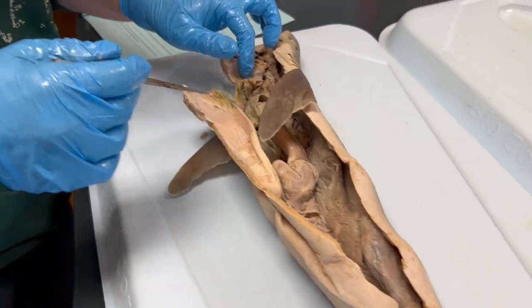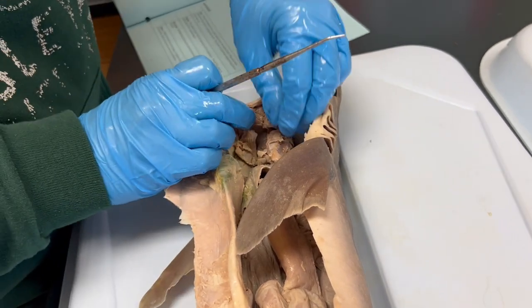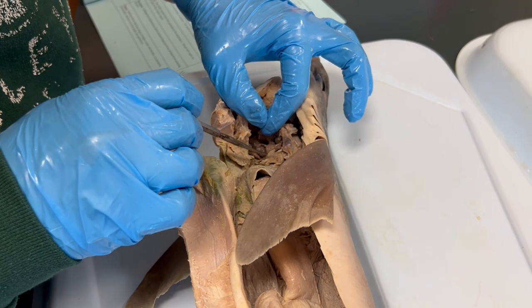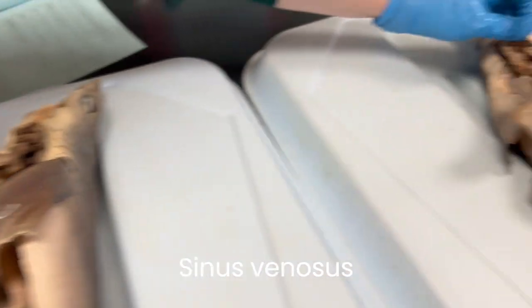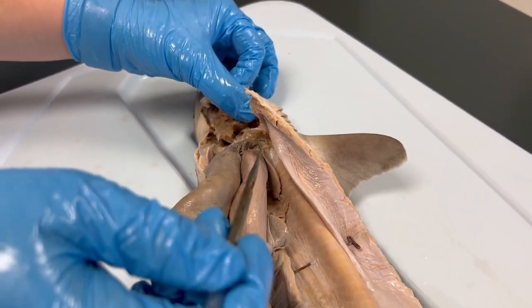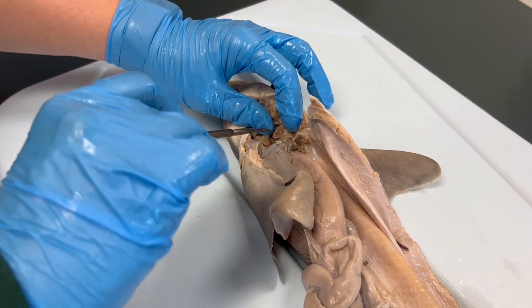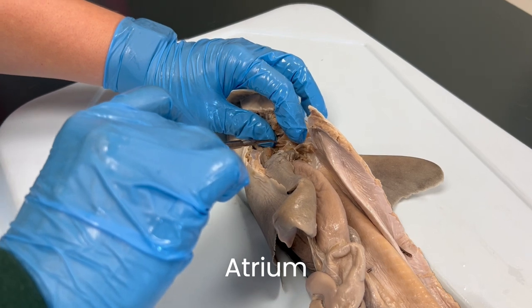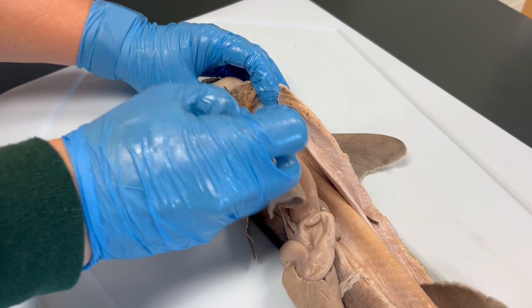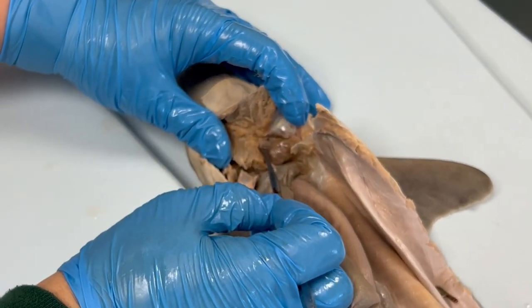Moving back cranially in the shark, we will look at some of the heart structures. The heart is very difficult to access in these organisms because it is well protected by thick cartilage tissue. Opening this up, there is a little white triangle of tissue called the sinus venosis, located just dorsal to the ventricle. Deoxygenated blood comes from the body and enters the sinus venosis, which then sends blood to the atrium. Sharks only have two chambers: an atrium and a ventricle. The single atrium is thin-walled with two lateral bulging lobes and pumps blood to the ventricle, which is significantly more muscular and responsible for pumping blood out of the heart. Blood leaves the ventricle via a blood vessel called the conus arteriosus.